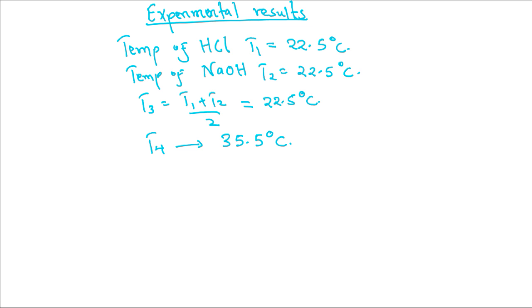So we want to use this result to calculate the heat change.